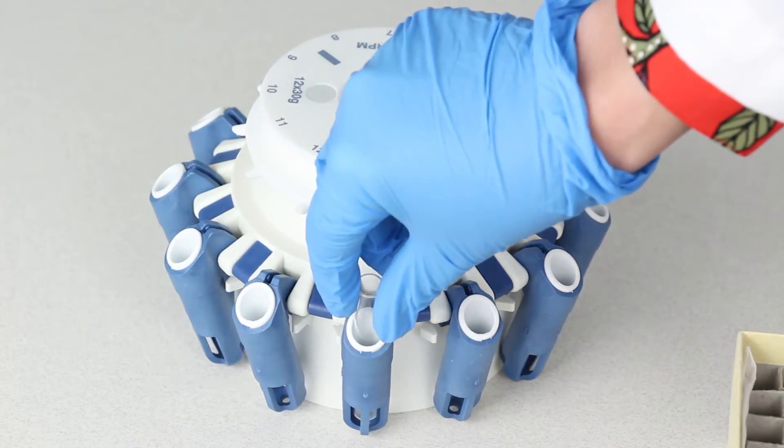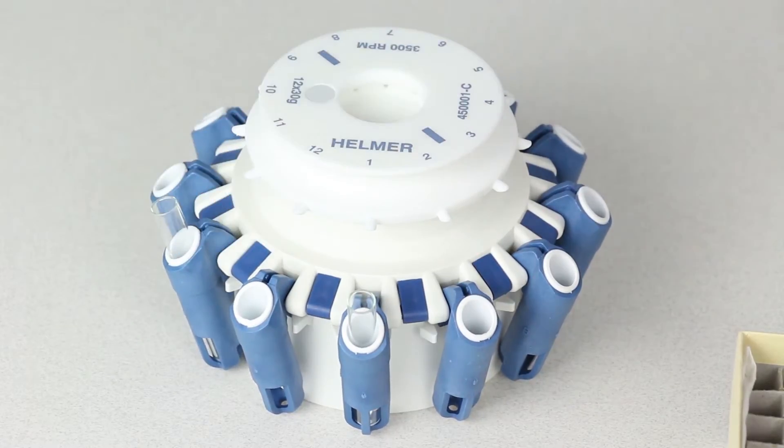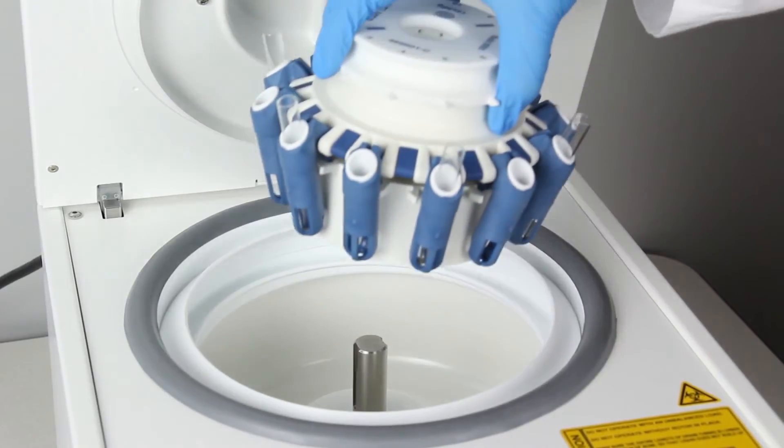First, load the rotor with tubes, leaving every other position on the rotor empty. Then, install the rotor and close the lid.